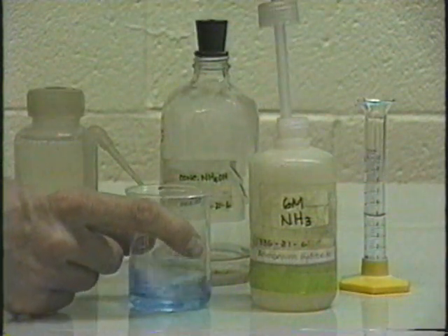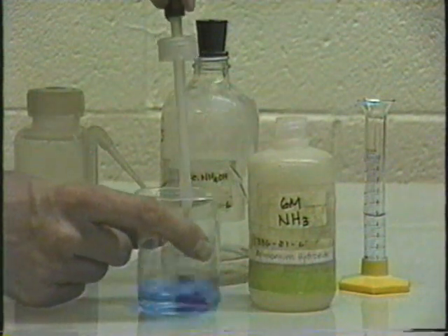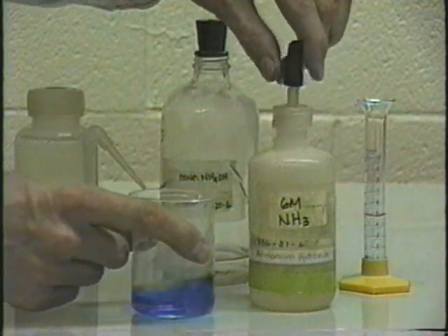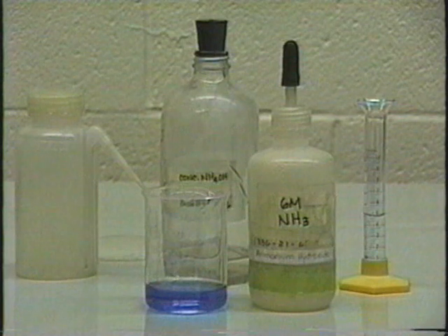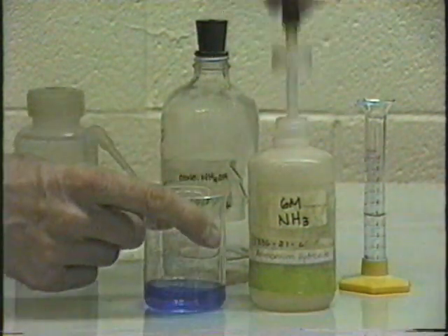There, now you see it's getting really, really blue there. Okay, now you see this change color. Now, in a little while this will precipitate here. At this point, well, we could add maybe just another drop or two here.